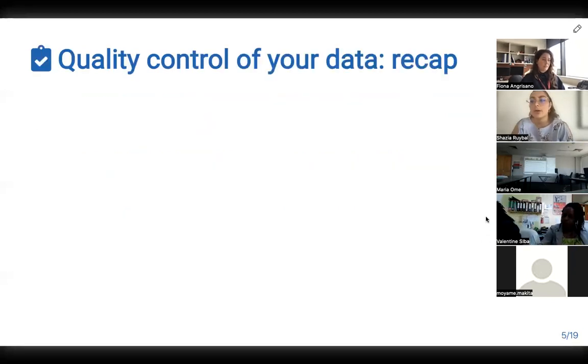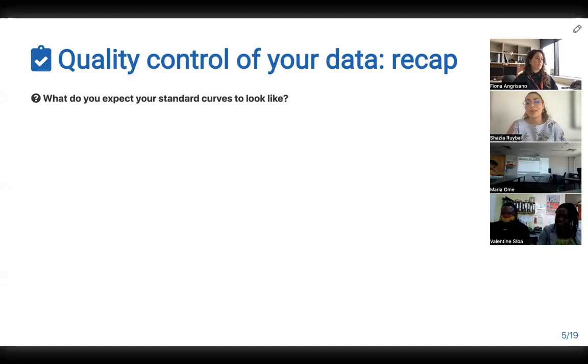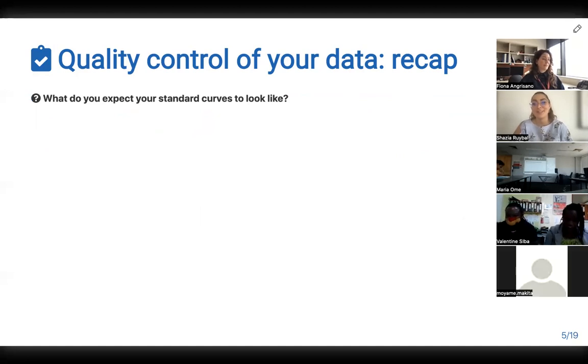Okay, so to do the quality control recap, I am going to be picking on some of you today, so I hope you don't mind. Also, feel free to just type it in the chat. What do you expect your standard curves to look like? Does anybody remember from last week? None of these questions are meant to be trick questions.